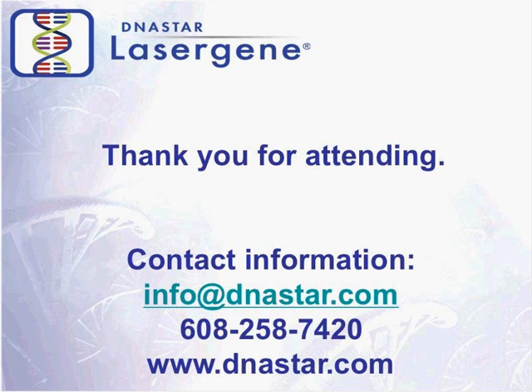Josh or Matthew, any quick comments on the incorporation of long reads? Yeah, we've been looking at PacBio pretty extensively here in the last few weeks. We have a number of data sets, and the long reads are more error-prone, and I think the most effective strategy, at least in the near term, will be using another technology like Illumina, or their own circularized consensus sequences, to essentially clean up the long reads to the point where they can be assembled effectively.